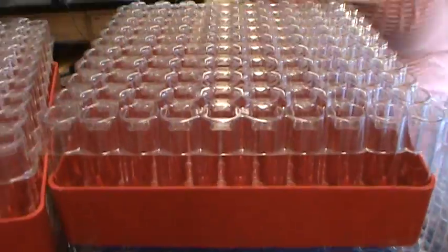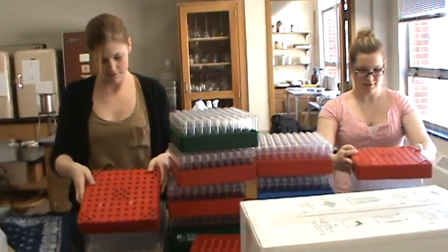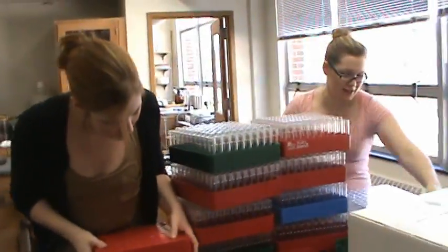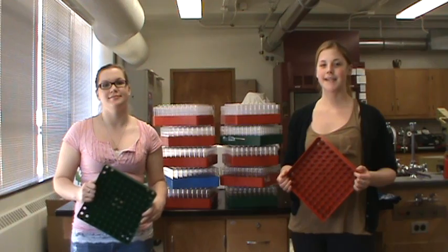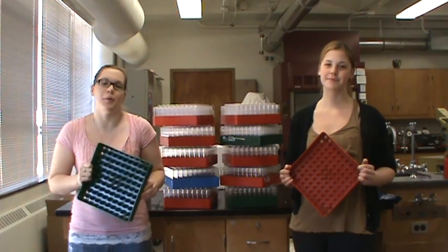Make it smooth like butter. When using the Genesee Scientific Reload System, it's important to take precautions against mold — namely soaking your trays in a bleach water solution every couple of months.